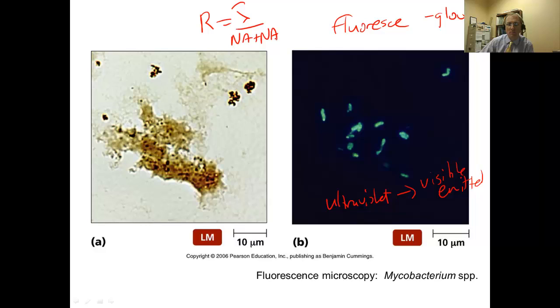And we recall that by playing with wavelength, we can lower wavelength to a point where we get better resolution, a smaller number for resolution. When we drop the wavelength down into the ultraviolet light, we'll have a much more improved resolution. But recall, ultraviolet light is not visible to the human eye. Because in a fluorescence microscope visible light is emitted, we're going to get that increase of resolution that we wouldn't be able to take advantage of by lowering the wavelength to something not visible with the human eye.